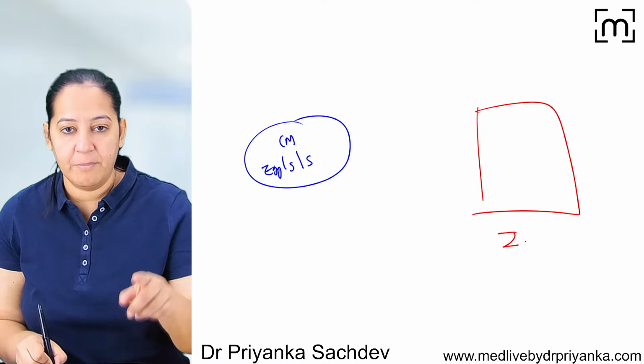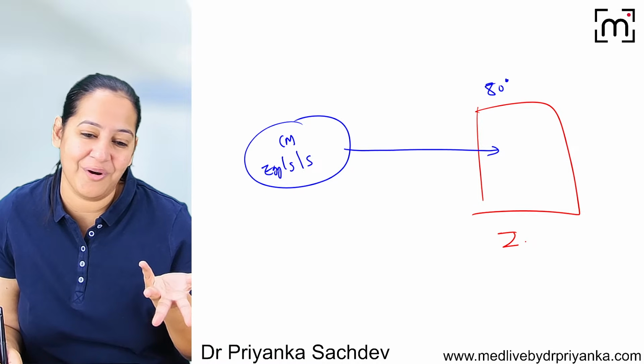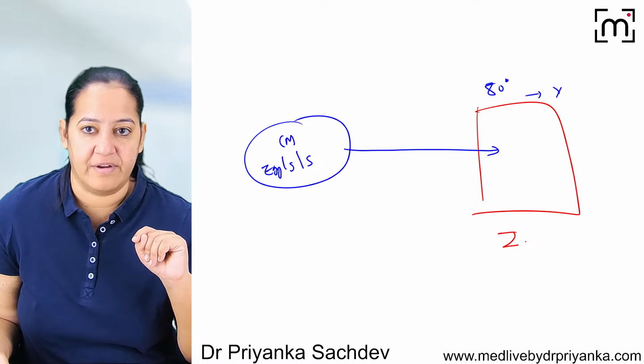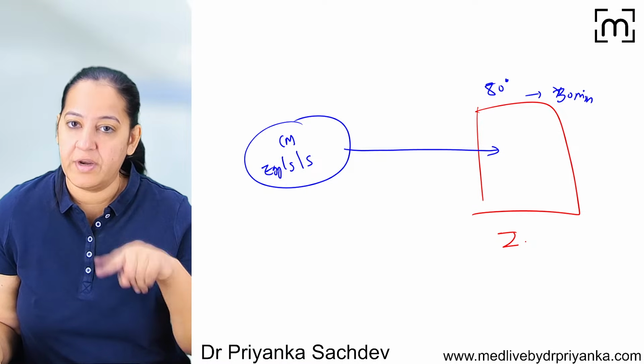So what I will do, I will put this culture media inside the Inspissator, and here the temperature is 80 degree. Because it is below 100 now, you cannot make it 100 or above 100. It is 80 degree. And we will heat it for half an hour, 30 minutes. Today, what is the day today? I guess today is Wednesday.